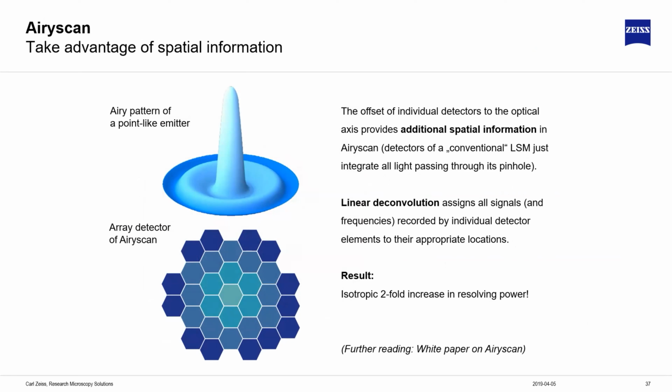All right. So we're projecting basically the PSF pattern across the Airyscan detector. This is obviously then a hardware solution that we're using to be able to capture this kind of resolution. But at the end, every single pixel is composed of 32 different elements of information. So we need to do some processing at the end to basically piece that all back together to a single intensity value at every position as well.